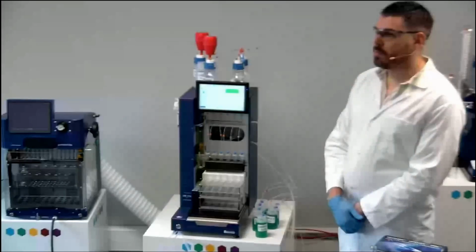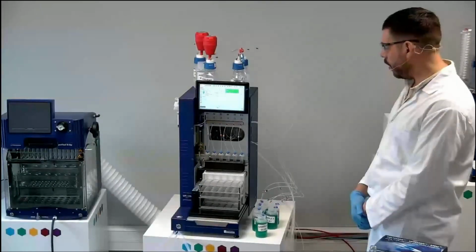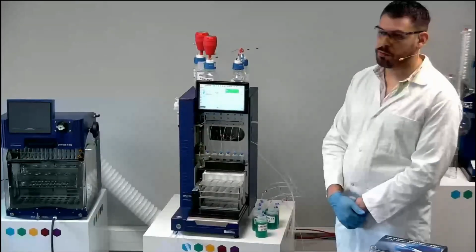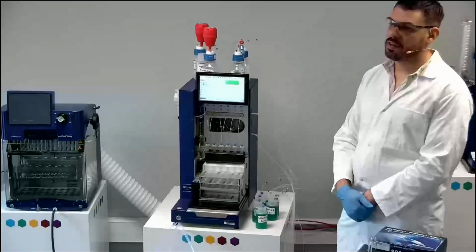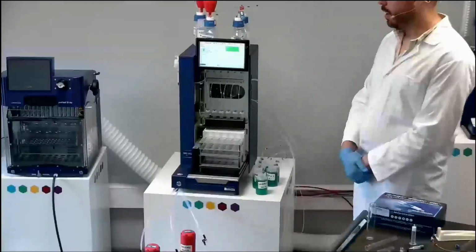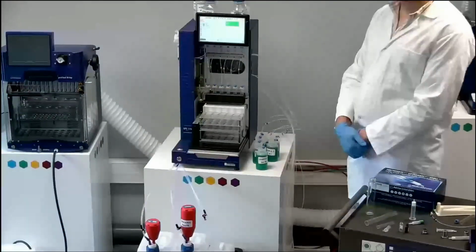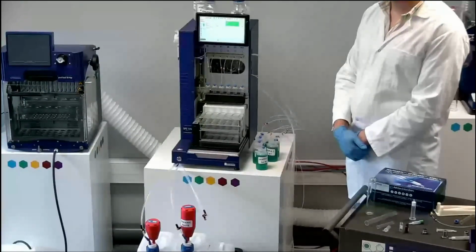I'm checking my methods. I'm drying my SPE columns. Here, I wash my columns with water to remove impurities, so my impurities go directly into the waste container. And I will collect my blue color, which corresponds to the elution fractions inside the sample.